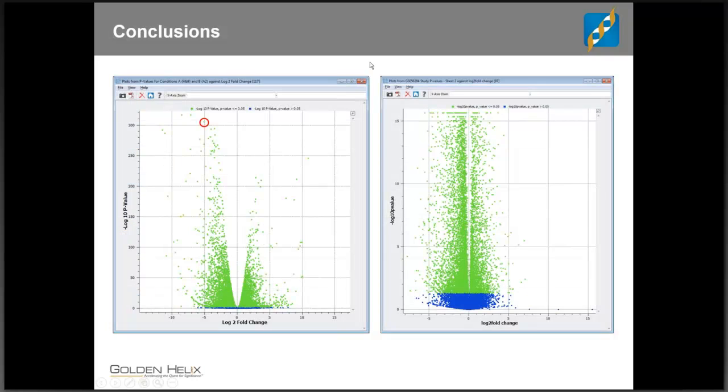One more plot I can show you in SVS are volcano plots. The one on the left was generated from the count data that we generated, and then the one on the right is the negative log 10 p-values and fold change provided by the authors that we simply downloaded.